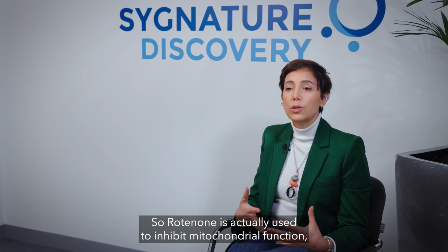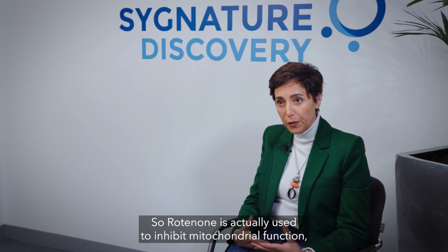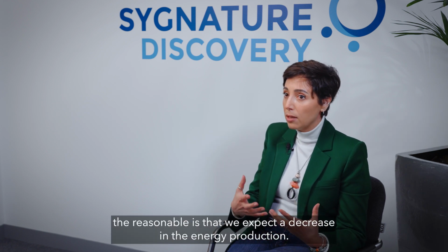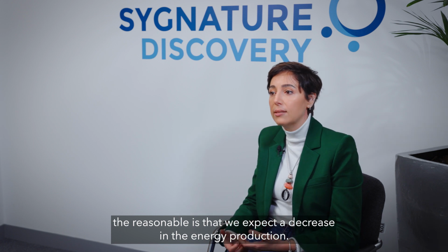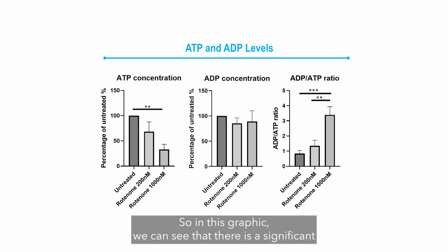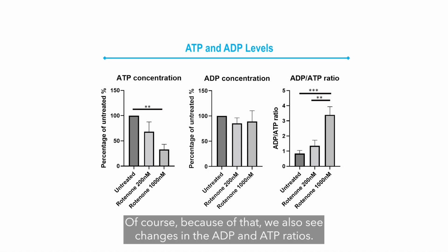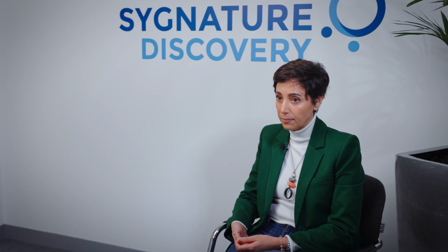Rotenone is used to inhibit mitochondrial function, and therefore, if it's inhibiting its function, we expect a decrease in energy production. In this graphic, we can see a significant decrease of ATP concentration in the cells. Of course, because of that, we also see changes in the ADP and ATP ratios.